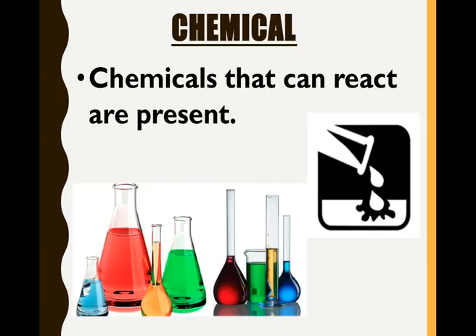This symbol, take a guess. What it actually means is that chemicals that are present could have a reaction. So they could react with other chemicals. They could react if exposed to air, water, things like that.